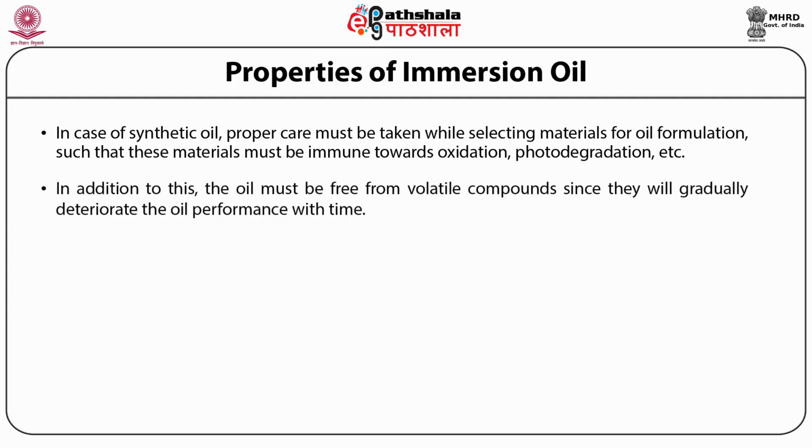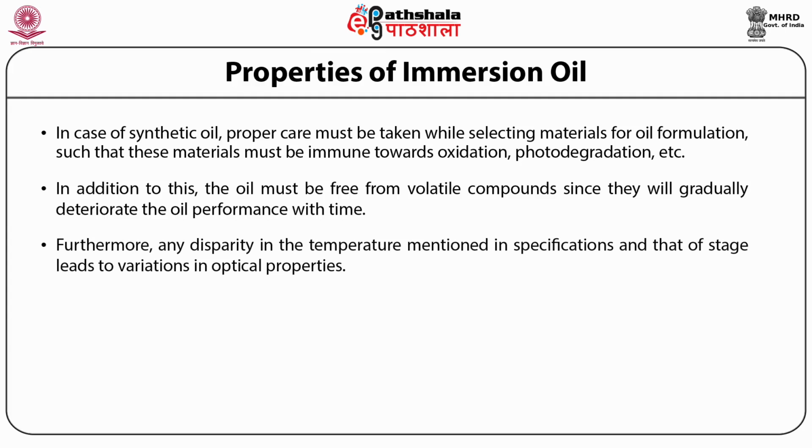In addition to this, the oil must be free from volatile compounds since they will gradually deteriorate the oil performance with time. Furthermore, any disparity in the temperature mentioned in specifications and that of the stage leads to variations in optical properties. Deviations occurring from stage temperature are the most severe and must be considered carefully.